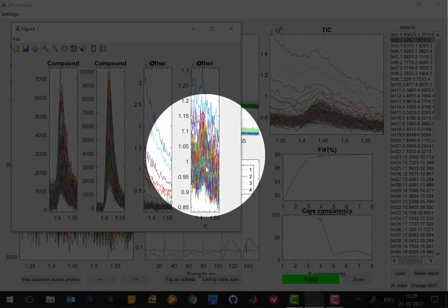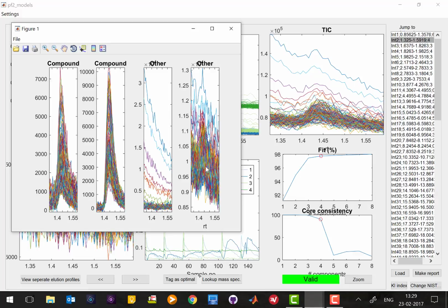And usually, by rule of thumb, we always want to model a baseline in GCMS data, because we know there is always a baseline which can be derived from either your column and your derivatization reagent you used, or simply has something to do with your mobile phase. So there will always be a baseline, and preferably we always want to model out the baseline. So you look at this peak and make sure which is actually a chemical component.